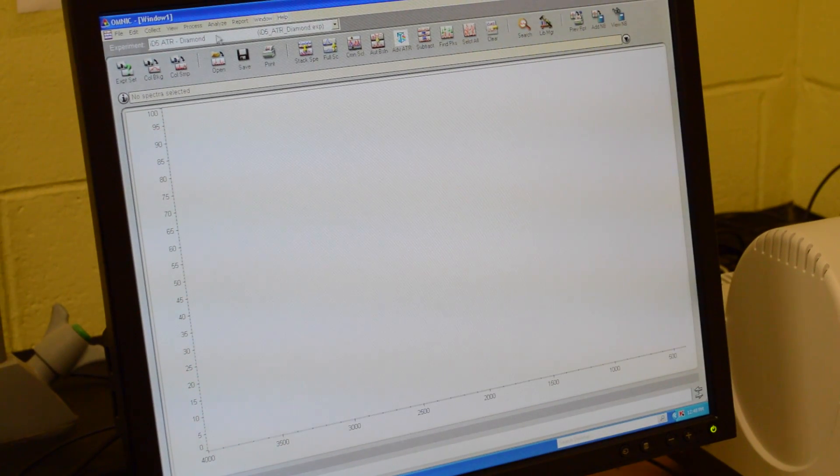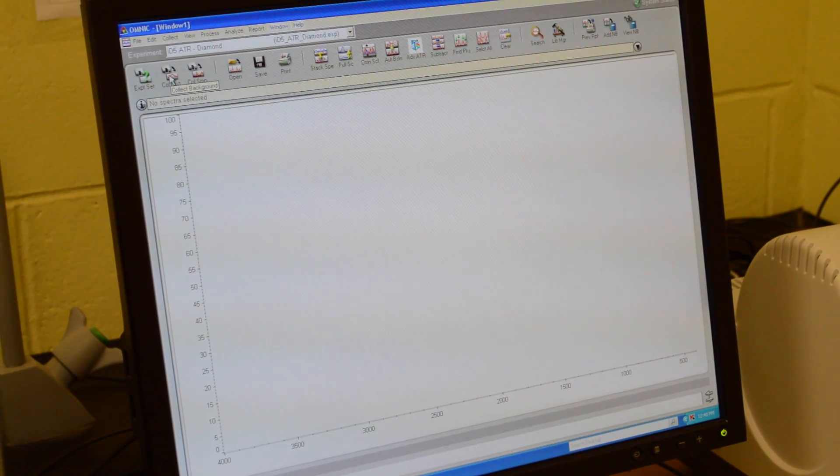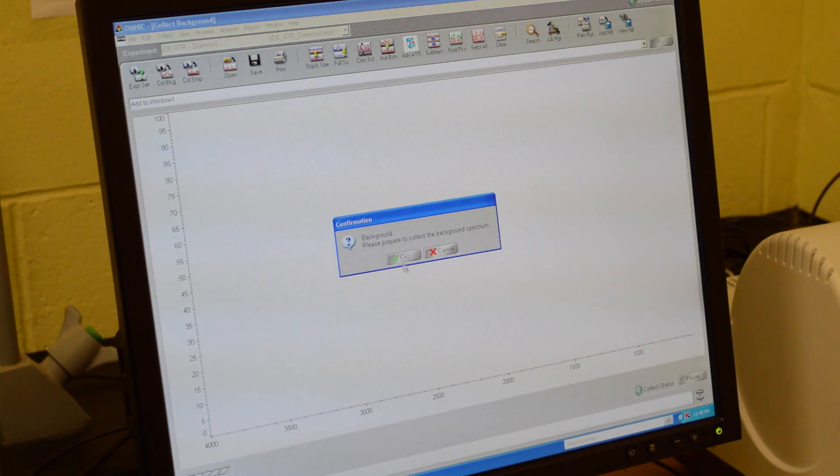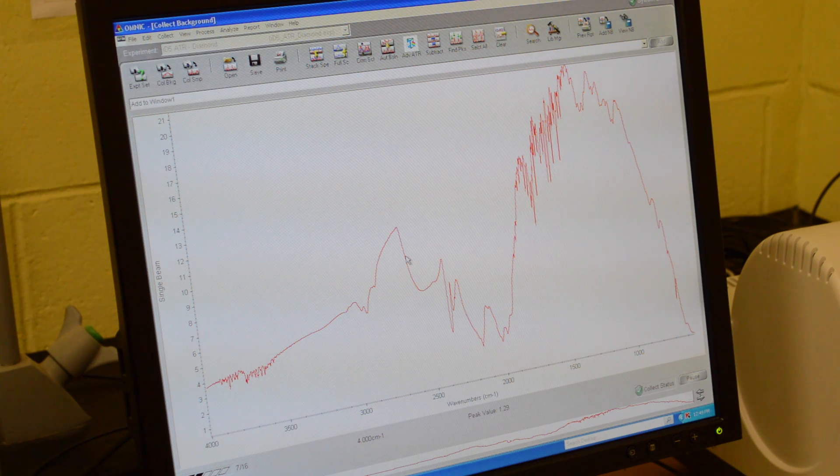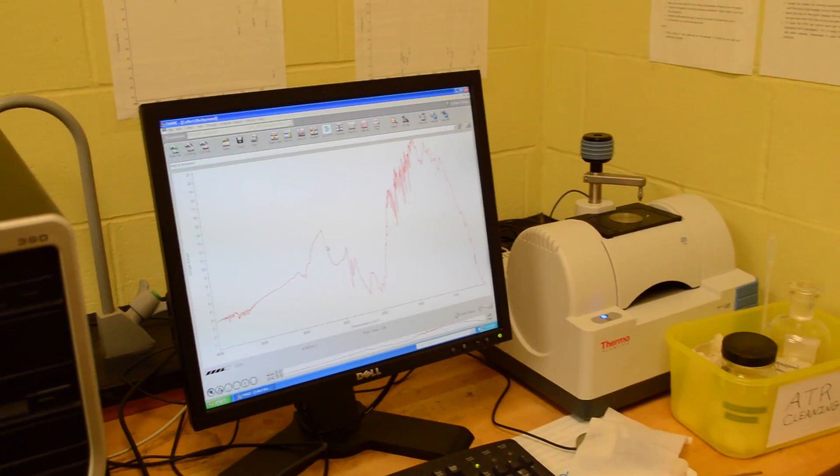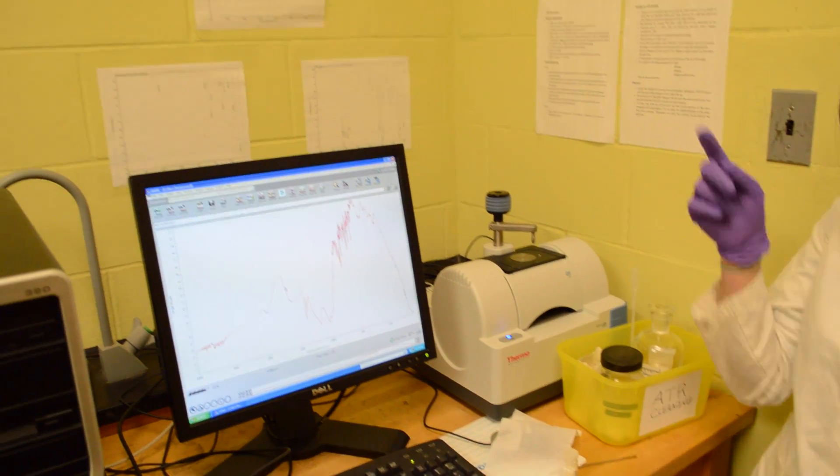Now the first thing you want to do is collect an air background. Press collect background, it says please prepare to collect background, if you're ready press OK. It will scan 16 scans. This is what you normally expect an air background to look like. It's very messy but this is what it should look like. If you're ever unsure, there's an air background posted on the wall.